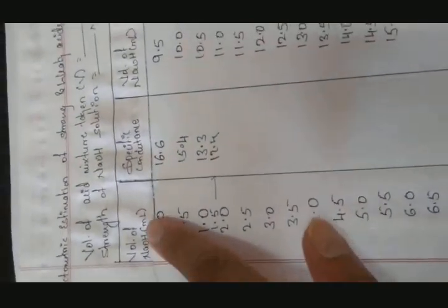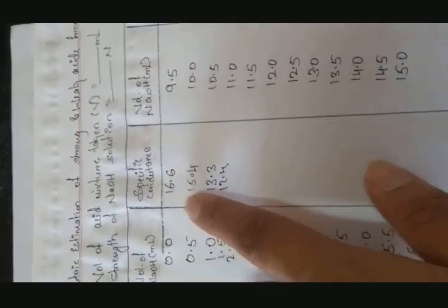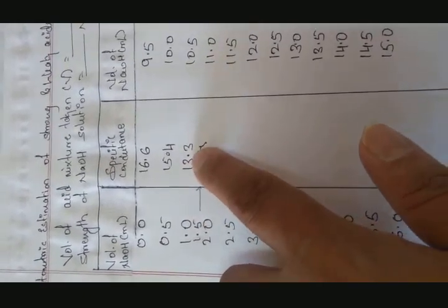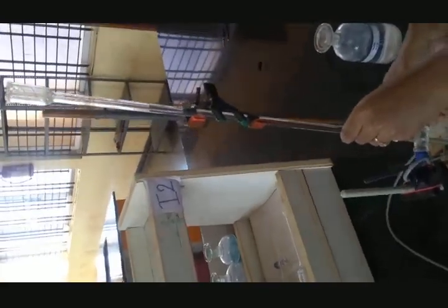Now at 0 cc you have to record the value without adding sodium hydroxide, that is 16.6, and at 0.5 it is 15.4, for 1 cc it is 13.3, and for 1.5 cc it is 12.4. Now go on adding likewise.